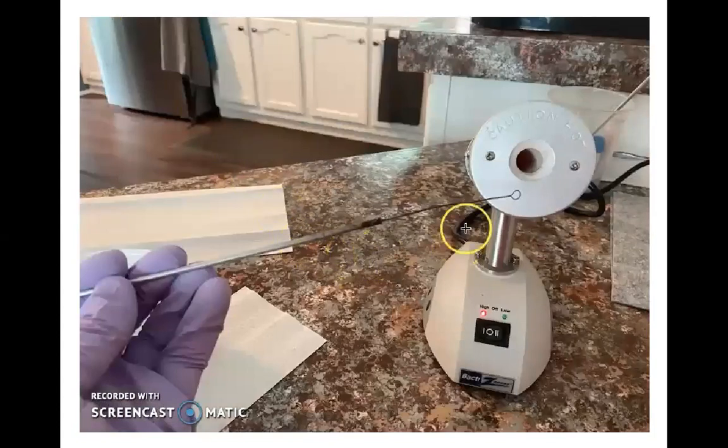Now, as soon as you withdraw the inoculating loop from the incinerator, the red hot color of the metal is going to go away. It's going to go right back to its regular color. But understand that this wire is burning hot right now. So the very last thing you would want to do is take this loop at this moment and put it into your broth culture, because you will sizzle that broth culture and you'll kill a whole lot of bacterial cells.